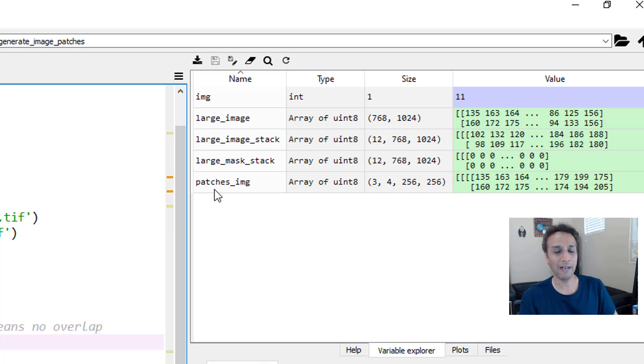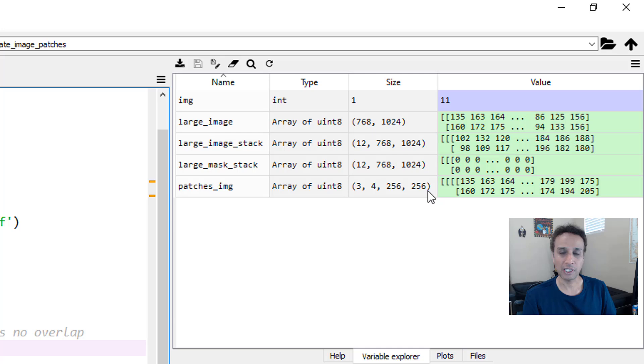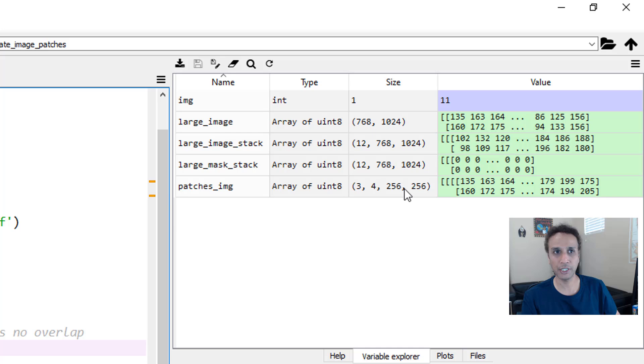Now I take that single large image and apply patchify of 256 by 256, so eventually what you get after applying patchify is an array of 3 by 4 by 256 by 256—self-evident, right? Three representing this 768 dimension divided by 256, and four this 1024 by 256, and then each image is 256 by 256.